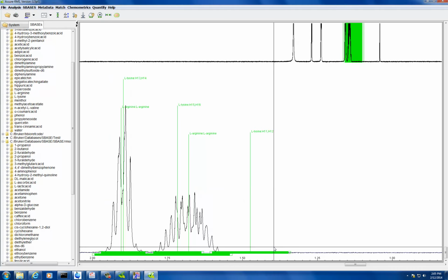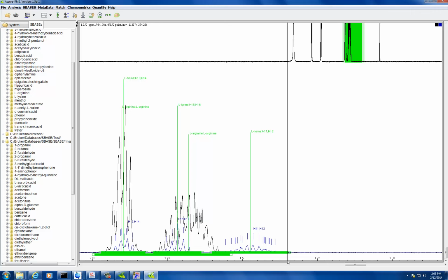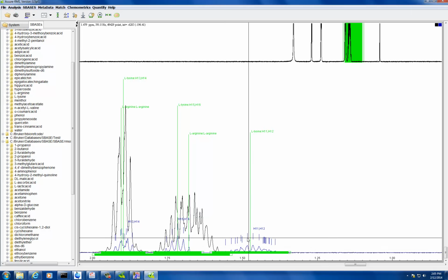Compound spectrum. Okay. It goes into your S space, and since you pulled it in there, you can tell it to come on screen as well. So this helps you because you might need to adjust it a bit more so you can move those areas. So how do you do that? If you take that region there, the tab, if you hold it, you can just move it anywhere.